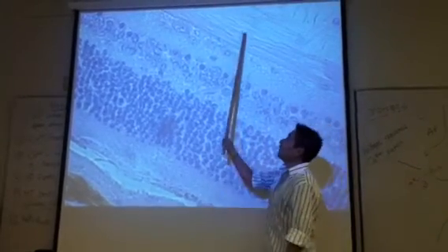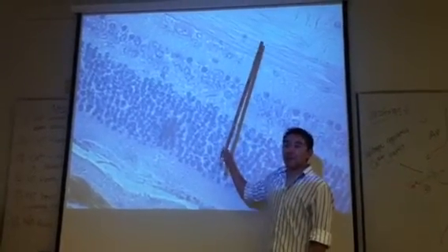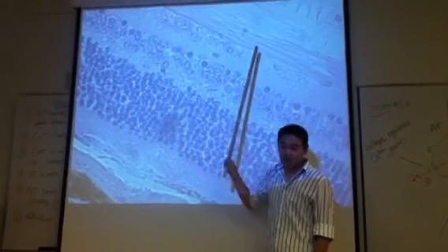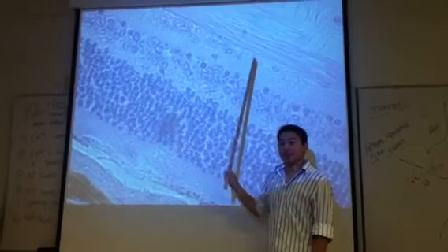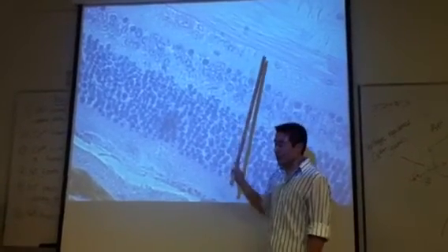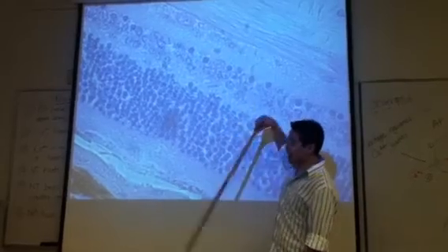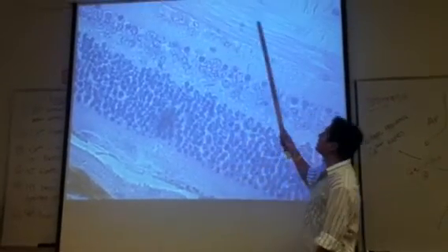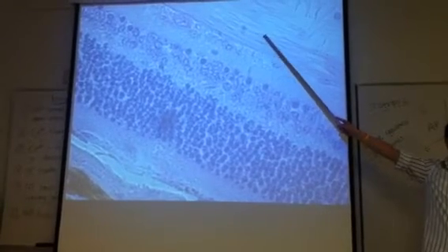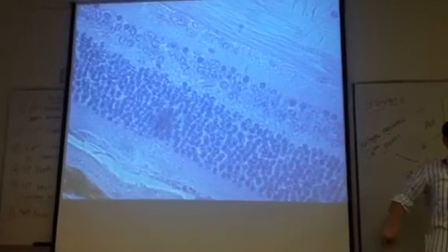So you guys all understand how this slide is oriented? If we were to continue to go that way, which part of the eye would we head towards? Anterior. Yeah, towards the anterior section, the anterior portion of the eye. The pupil. The lens. This is backwards. So, this right here would be what part? What layer? Or what part of this? What structures are in there?